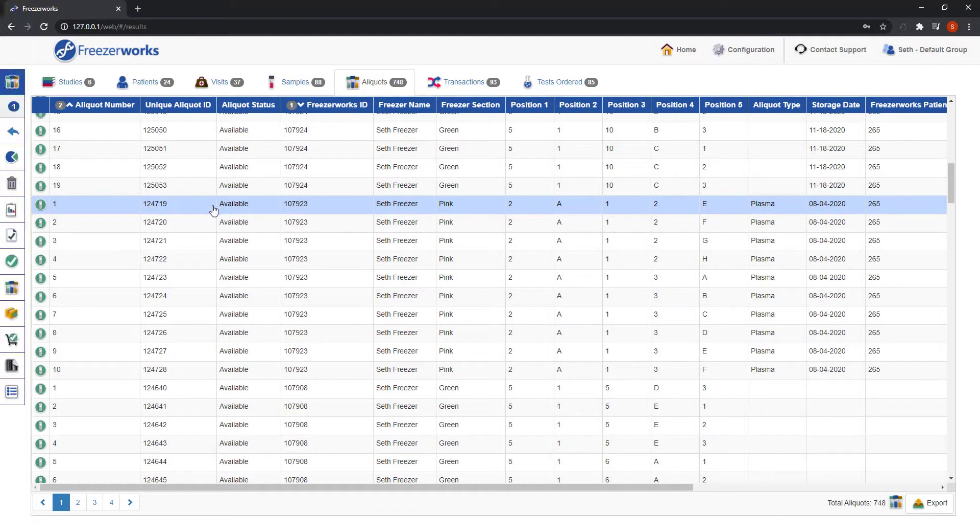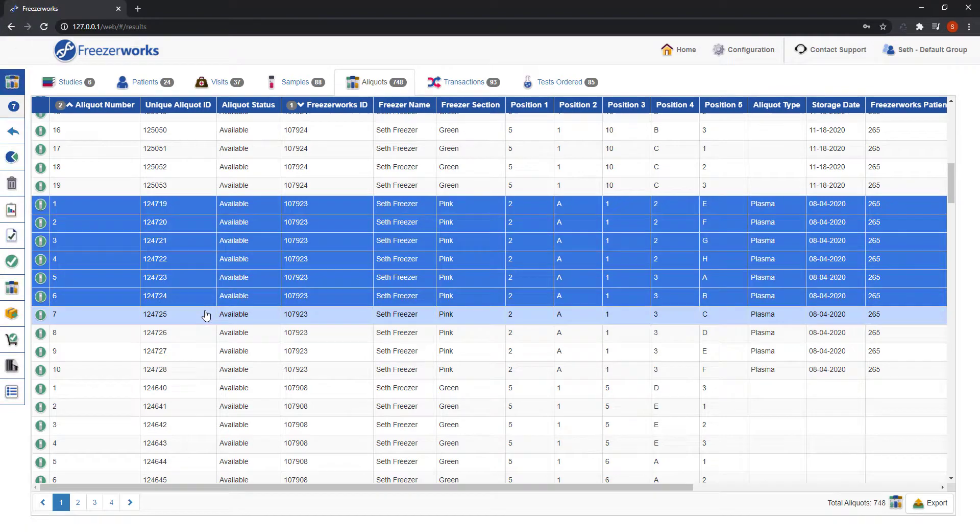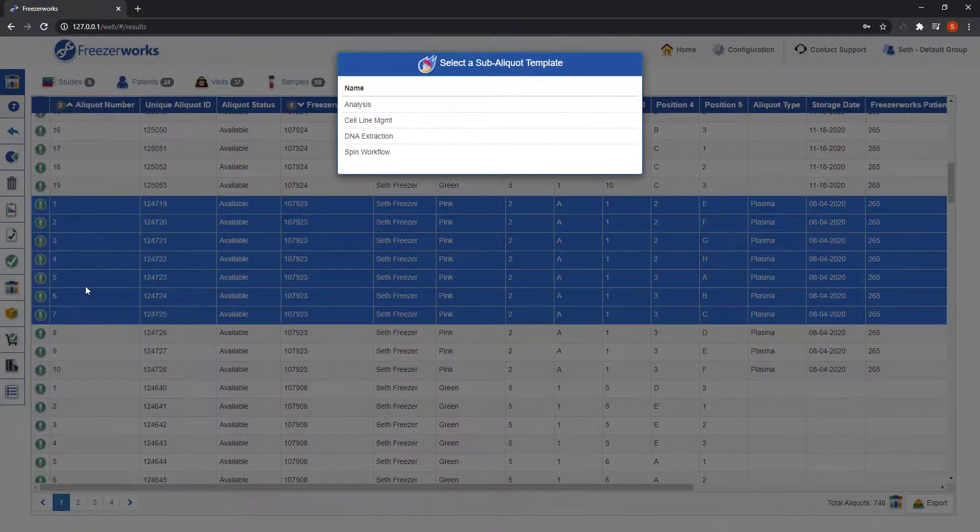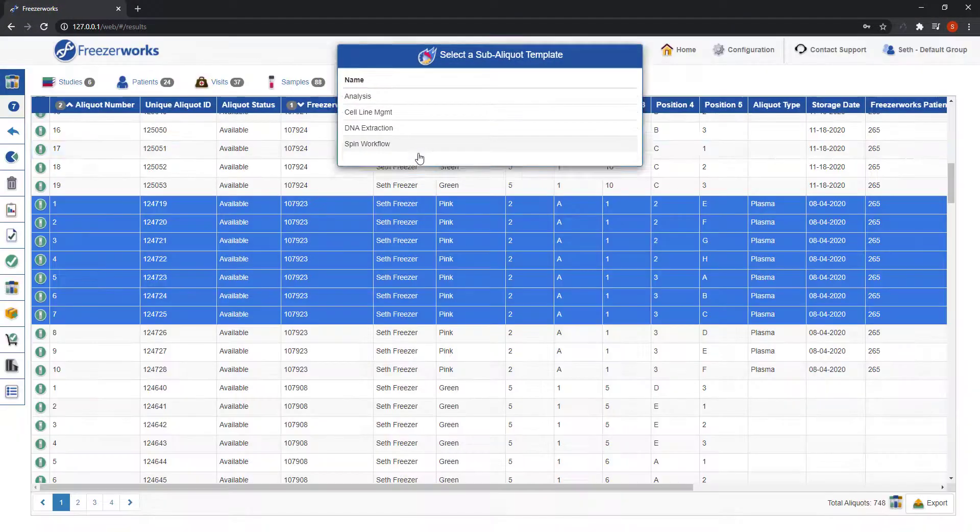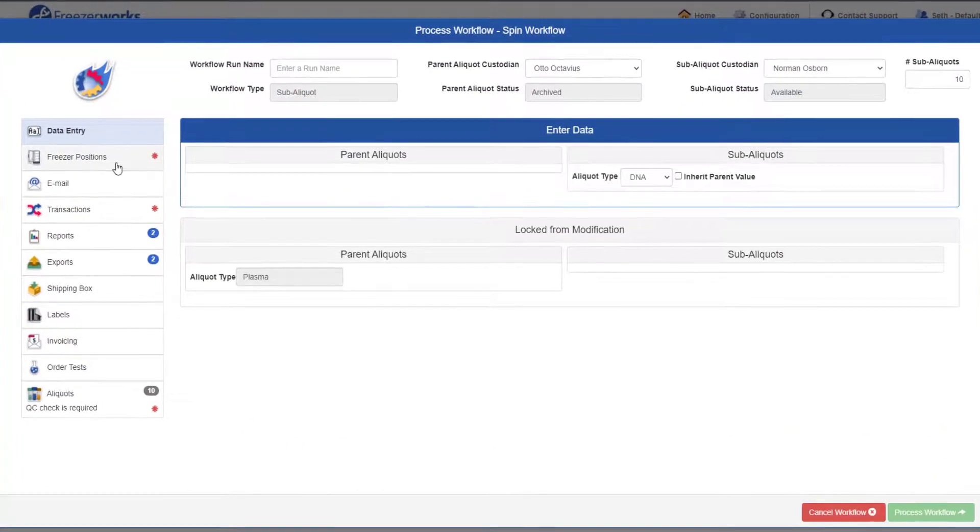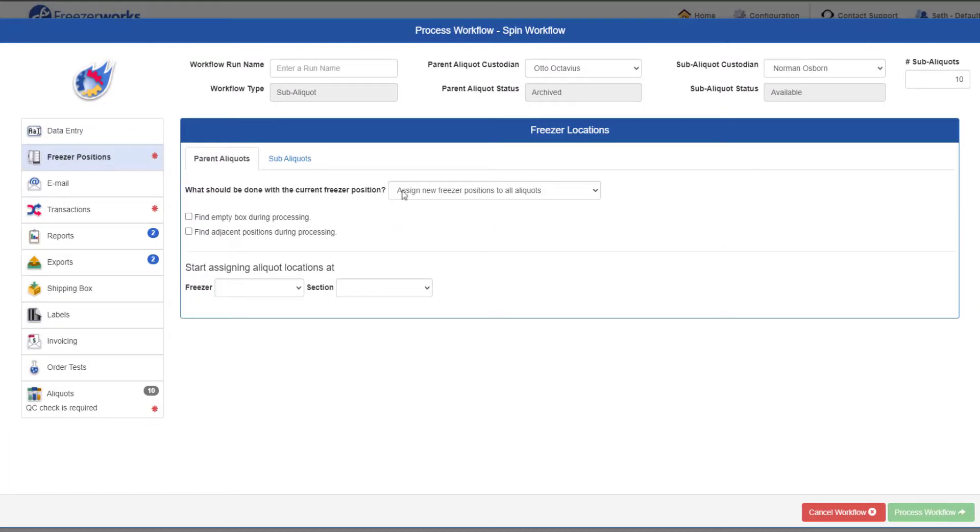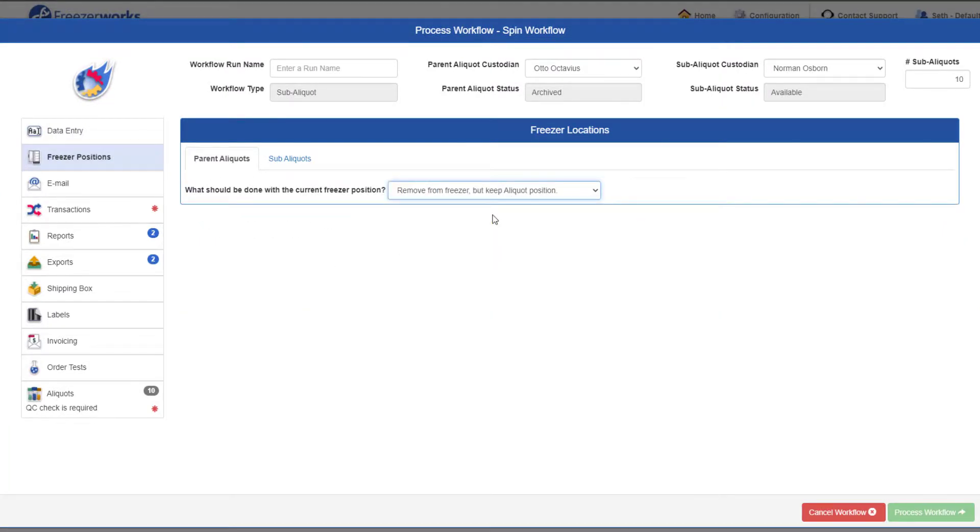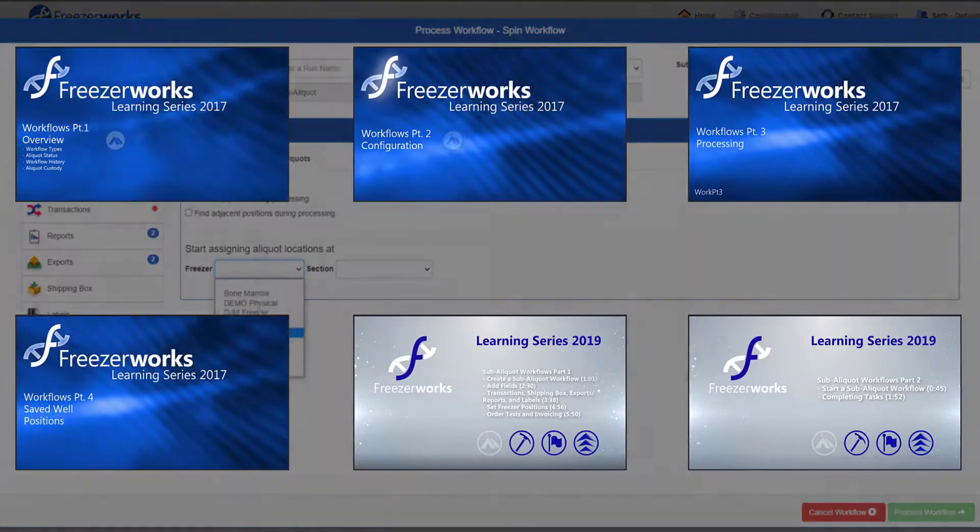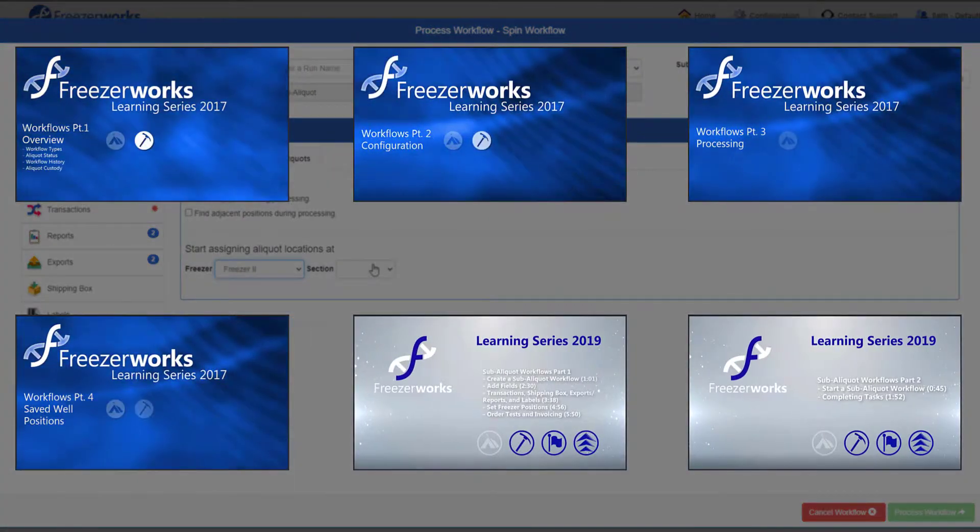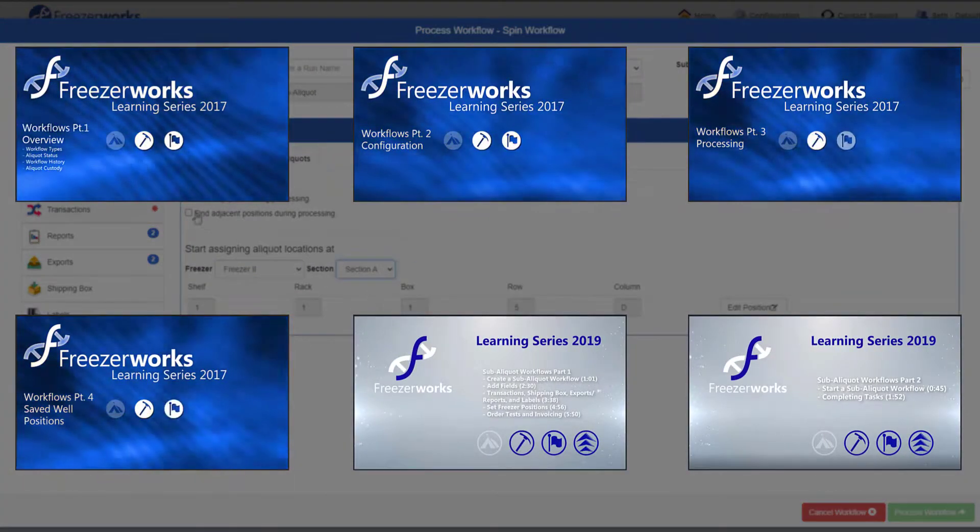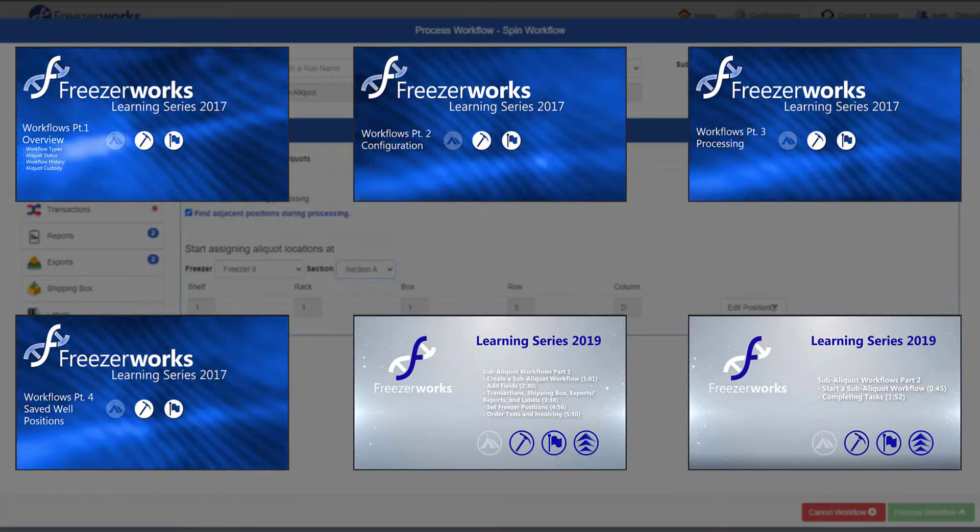Recently, we added sub-aliquot workflows to our set of workflow types, allowing you to take greater control over one of the more complicated processes. If you'd like to know more about those workflow types or workflows in general, we have many older workflow videos that still apply to the current program and more are coming as well.